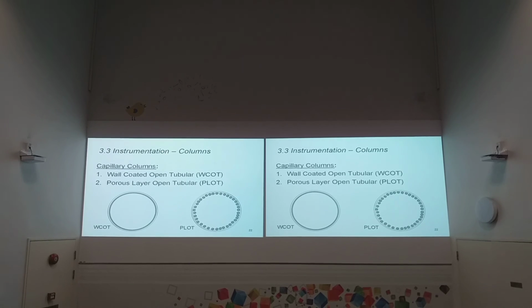You imagine the column is already so tiny, but now with good engineering techniques, we are still able to coat the internal surface with a very, very thin layer of liquid solvent, which is on your left. So one whole layer, homogeneously, a layer of organic solvent, that's called WCOT, coated with a special solvent.